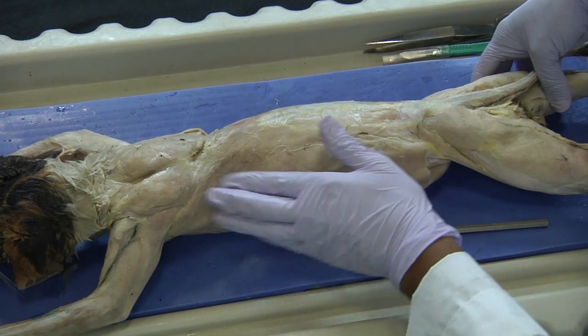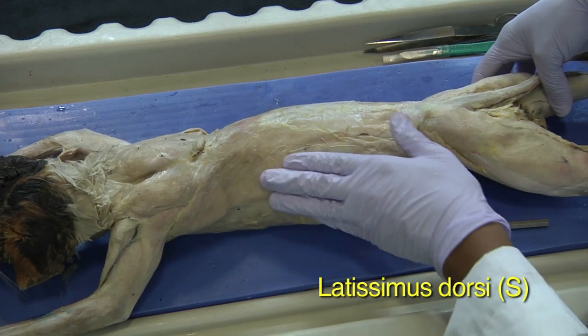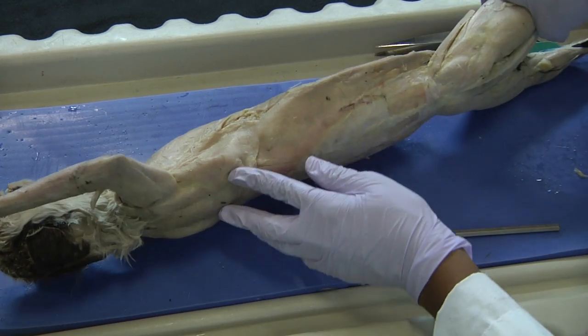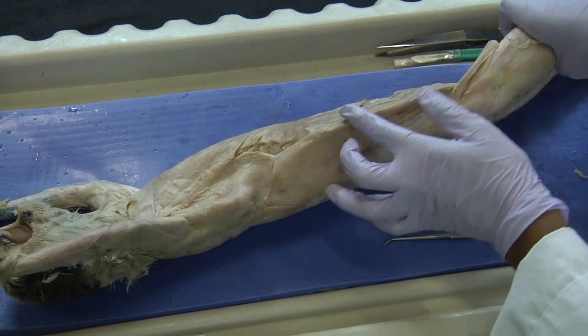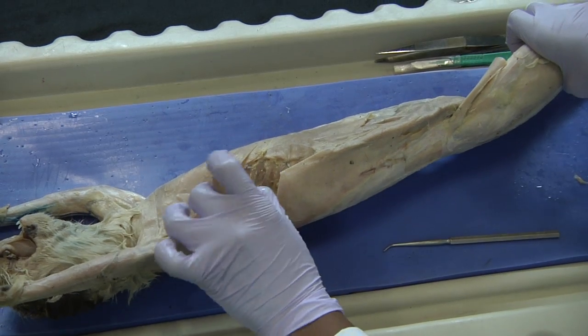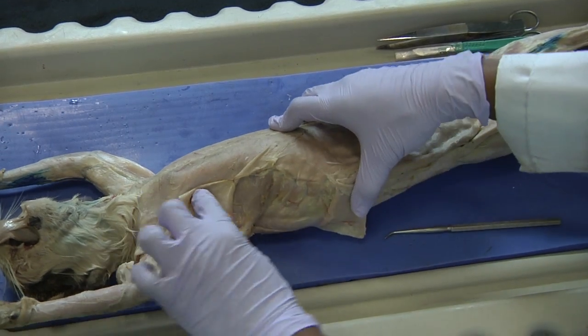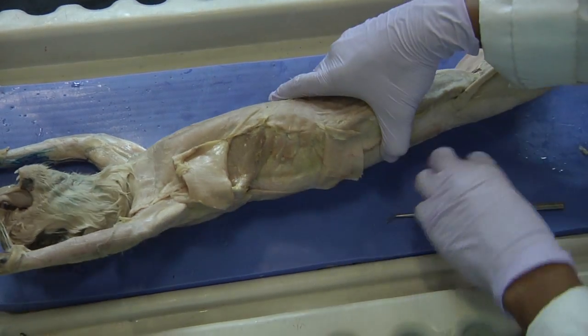So I have the latissimus dorsi here on the superficial side. I made the exact same cut to isolate the latissimus dorsi and went ahead and bisected that muscle to reveal the deeper intercostal muscles.